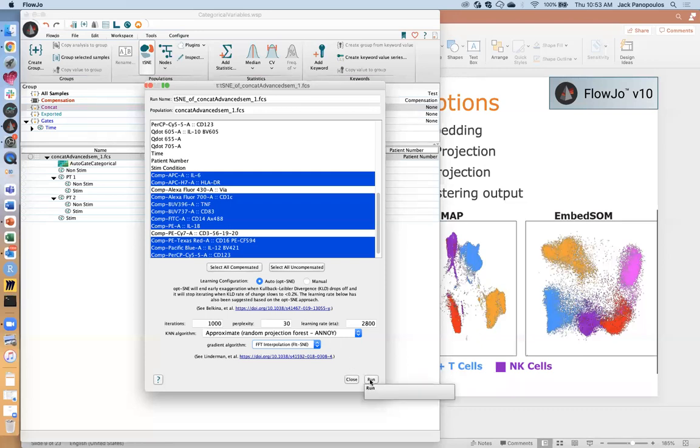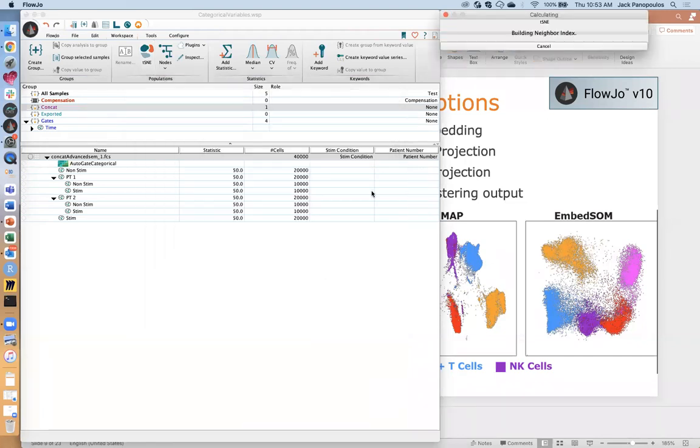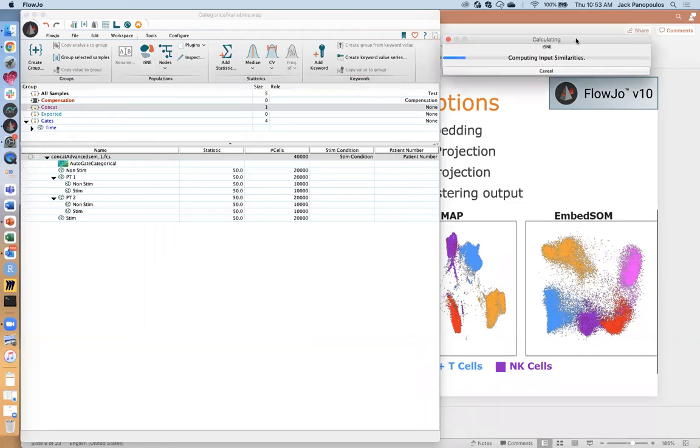All right, so we'll go here and we're going to click run. And then this should not take very long. tSNE will produce some results. In fact, I think that this version of tSNE is faster than UMAP. So if you actually try to run one next to the other, tSNE will actually run faster.